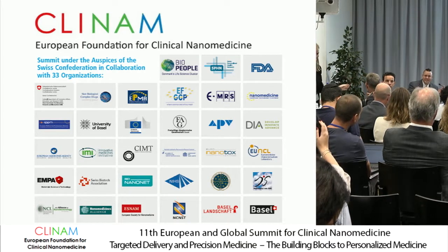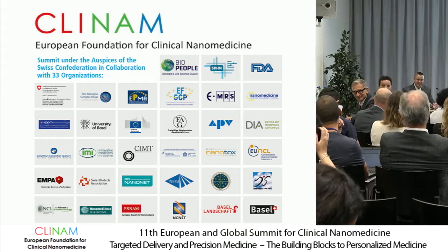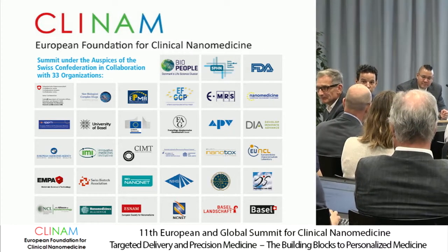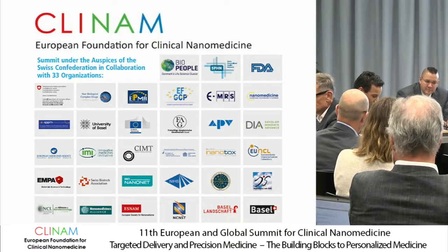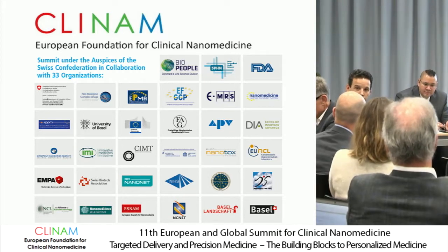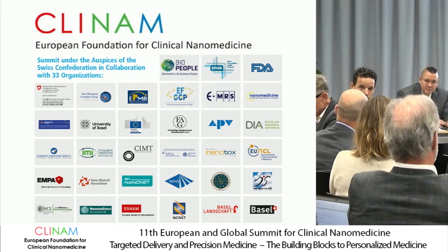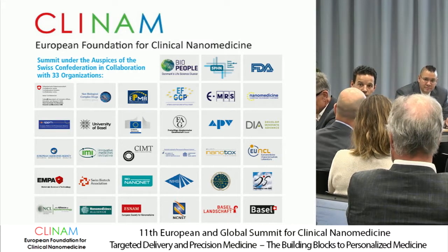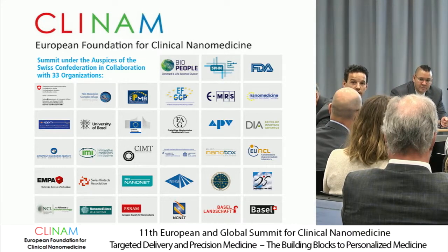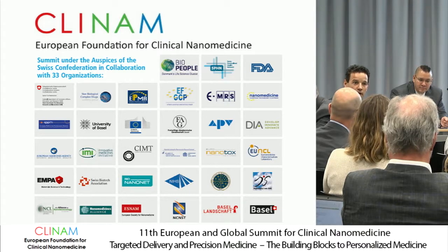Yeah, I can comment. I think indeed I'm familiar with the ACE Nano project. And you also use A4F as one of your techniques. So definitely the more knowledge is presented, the better it is for the development of a nano product for medical application. I presume your basis is more a manufacturing material as such, but the lessons learned are valuable, and the techniques and the development of standard operating procedures are very important. Because if these are not consolidated with calibrators, with reference material, then there is no transfer over to different applications.